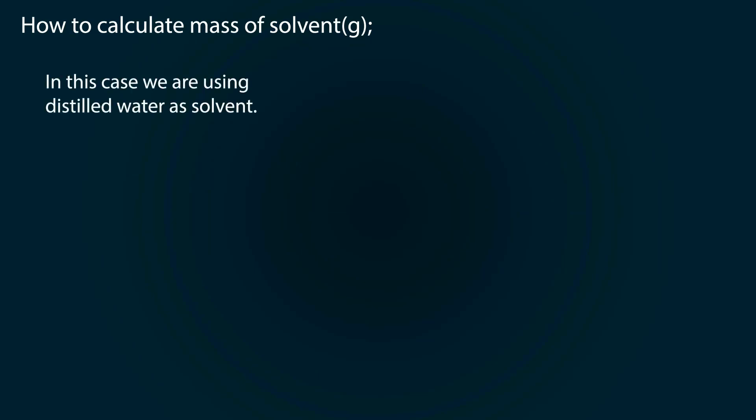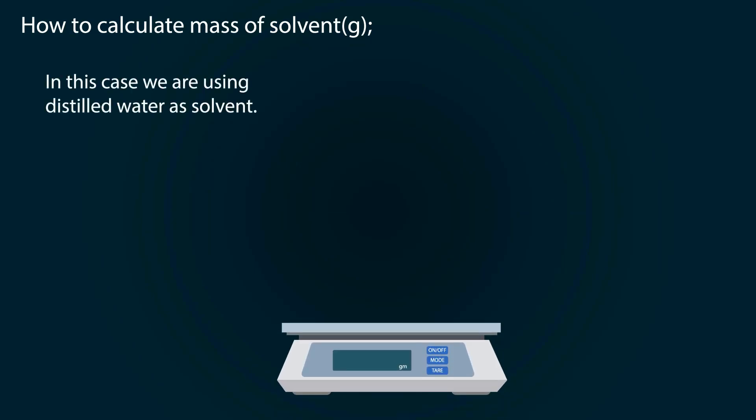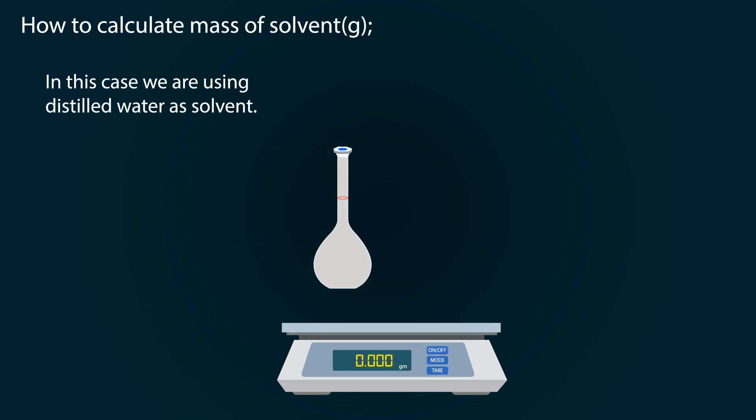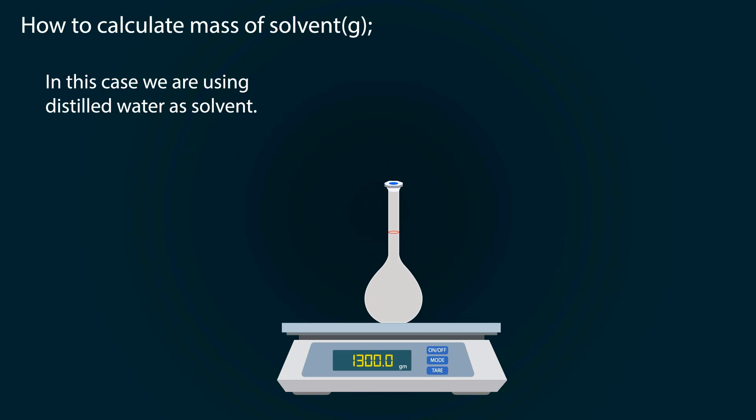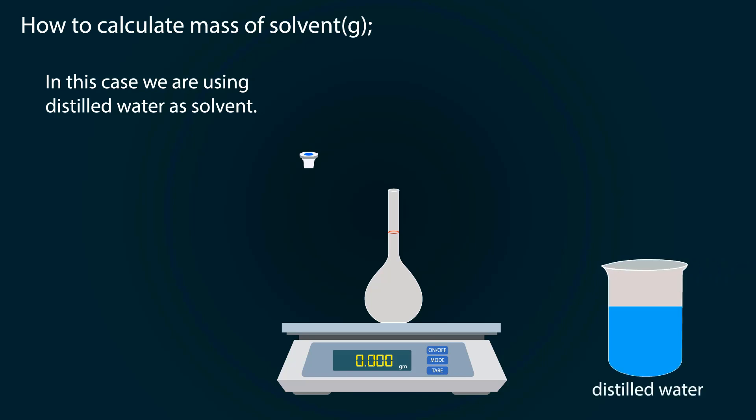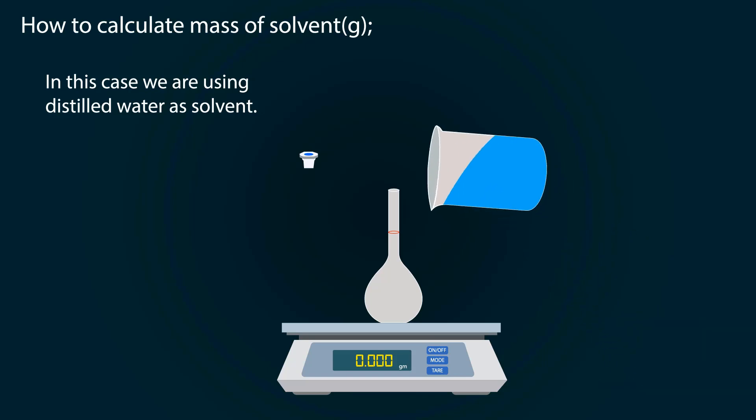The solvent we are using is distilled water. So take a weight balance and power it on. Put the volumetric flask on it and tare it down. Now start adding distilled water into the volumetric flask up to the 1000 milliliter point.